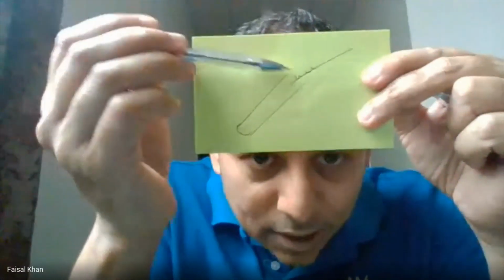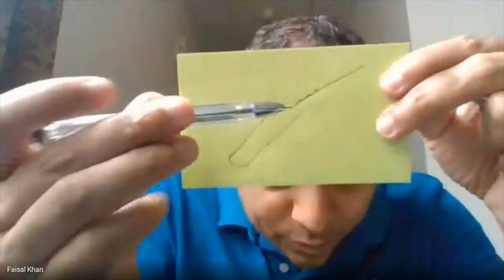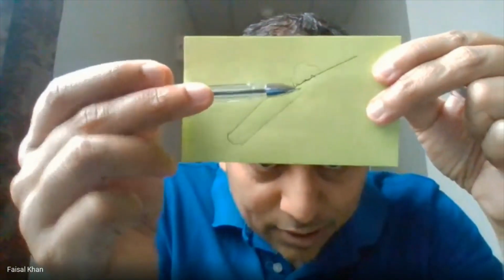this would be the test that you would have for oxygen, okay? It's a glowing splint. So this is a glowing splint, and you would place it inside the test tube of oxygen, and the positive test would be that it would relight, okay?